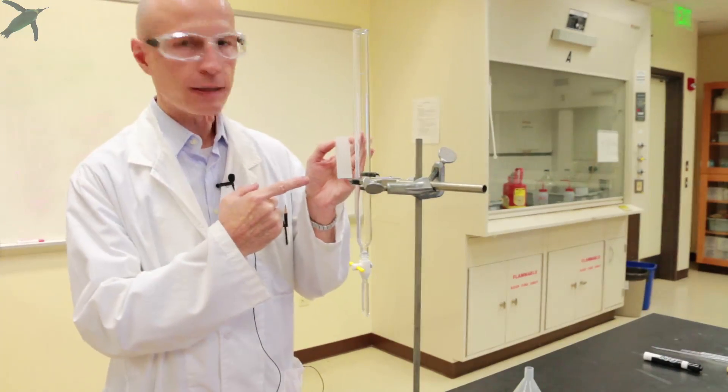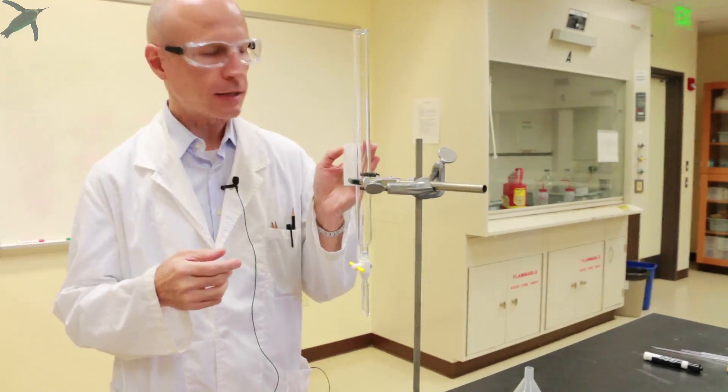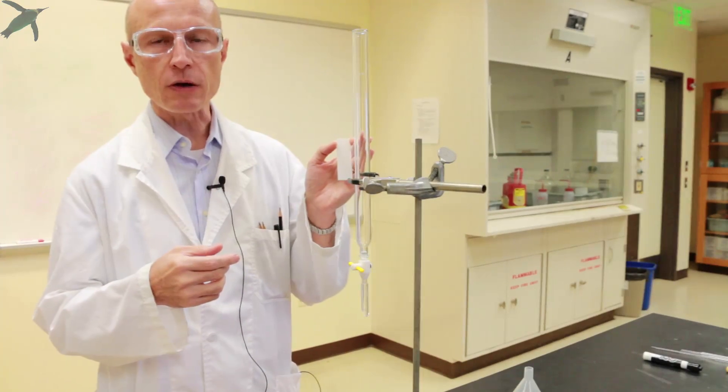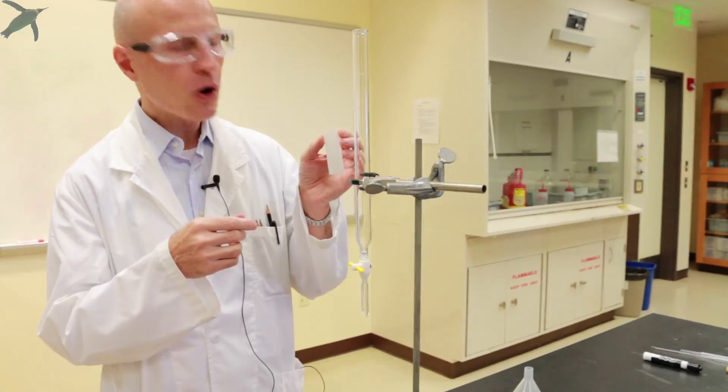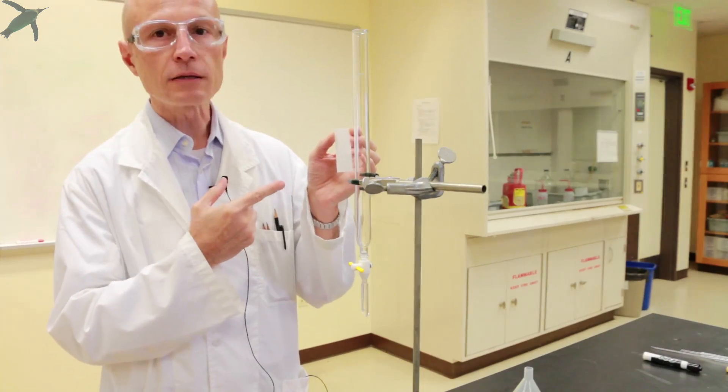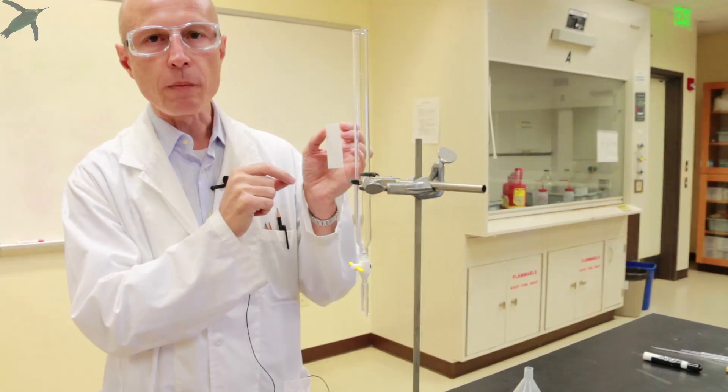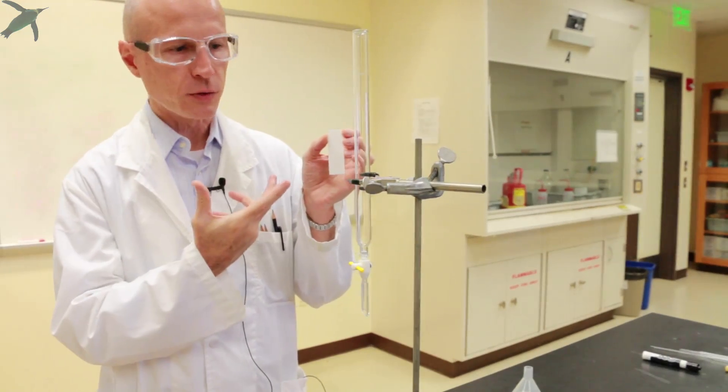You are already familiar with TLC, which is a separation technique that uses silica gel chromatography. TLC is an analytical technique, meaning that all you get out of this technique is information. You're using way too little compound for it to be practically useful.